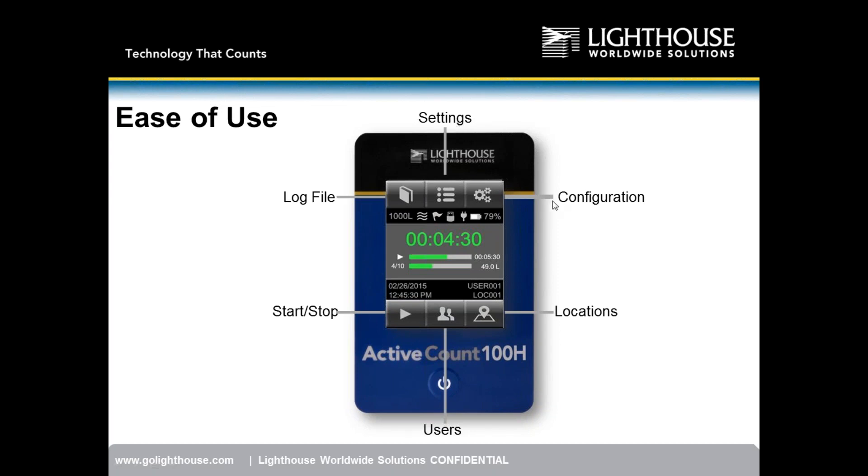Across the top you can see the volume of air to be sampled, airflow status, instrument status, USB key status, power connection, and battery charge — currently at 79%. In the center is a countdown timer showing time remaining for the sample, plus a sample status bar showing how far along sampling is. In periodic mode, you can see we've completed 4 of 10 samples and accumulated 49 liters.